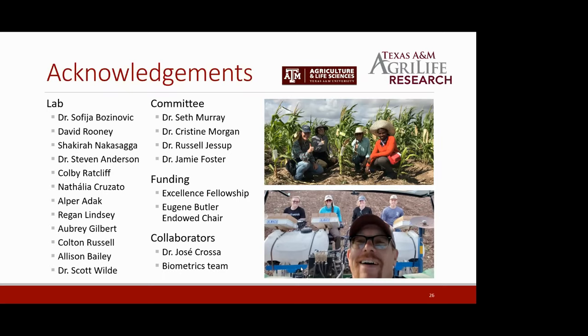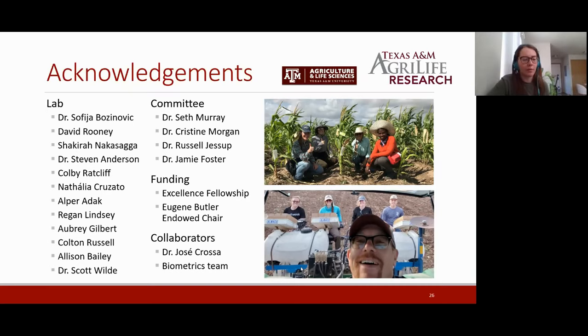Merrill asks, if you plan to use NIRS for pre-screening, can stress still be applied to seeds to improve the results? If so, which stress at which stage specifically will be better? That's a good question. Should the stress be applied to the plants that you're going to harvest and scan, or should you apply stress after you scan and then plant those seeds? I think we don't know yet. In this case, we definitely had significant drought stress and heat stress, and I think that worked well for us. But the details of these protocols are still yet to be discovered.